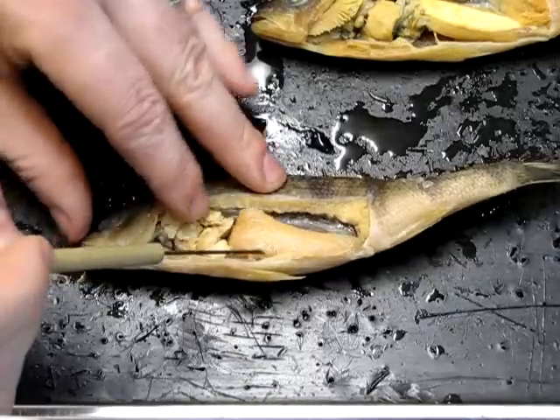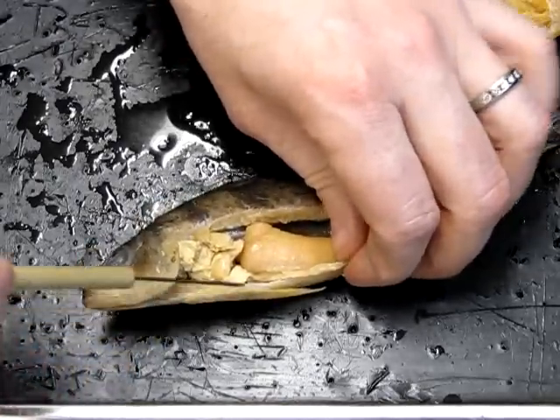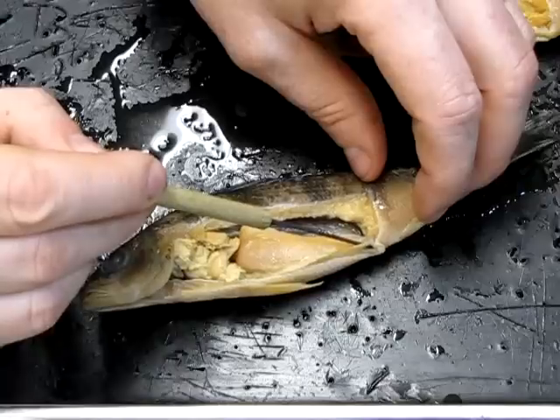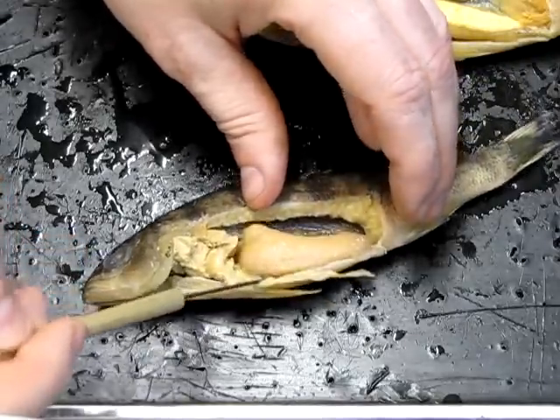From the stomach, the digestive tract turns into the intestine, which runs along the ventral surface of the animal. The intestine has been dislodged from where it would exit at the anus, but you can see it here along with a few more coils lying underneath.